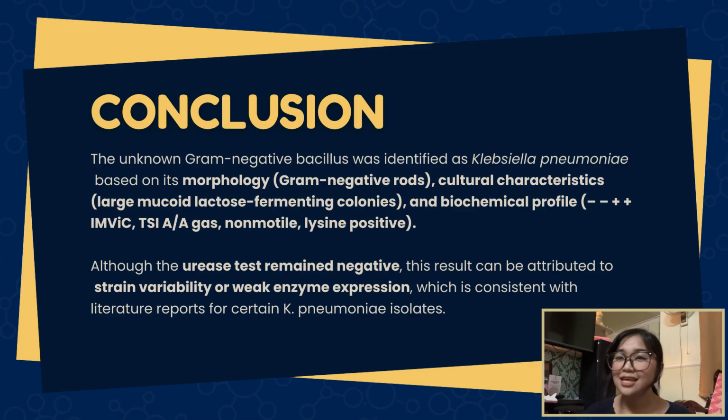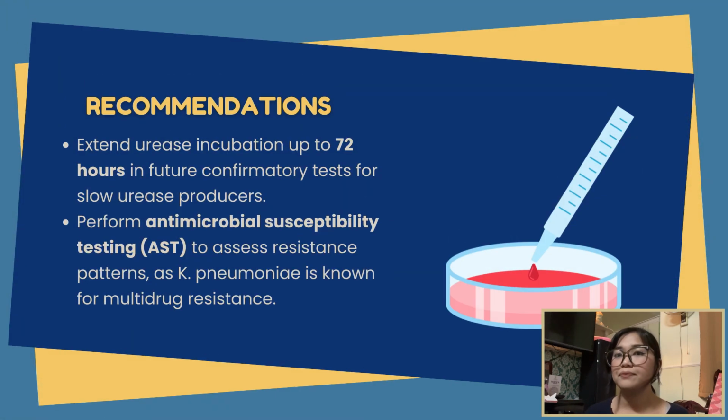In conclusion, the unknown gram-negative bacillus was identified as Klebsiella pneumoniae based on its morphology, cultural characteristics, and biochemical profile. The negative urease result was most likely due to strain variability or slow urease expression. That is why I recommend the following. First is to extend urease incubation up to 72 hours to detect slow urease activity, which is what I failed to do on my part as well.